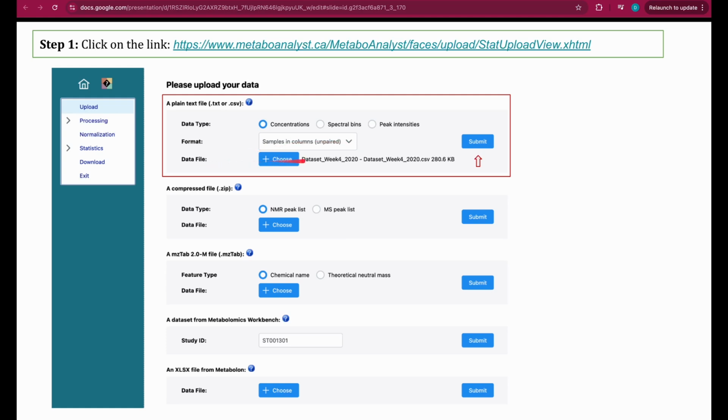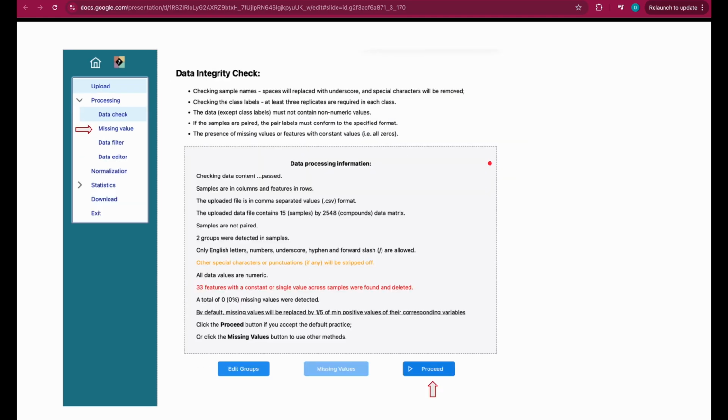And now I have to upload my data file. In this case make sure that the data file is in .csv format, because it only accepts .txt and .csv. Even if you have .xls format, which is the Excel file format, just go to MS Excel and save as .csv. In file format you can select .csv or .txt, and then you will be able to access this file and submit it. Now after submitting, the result would appear like this.